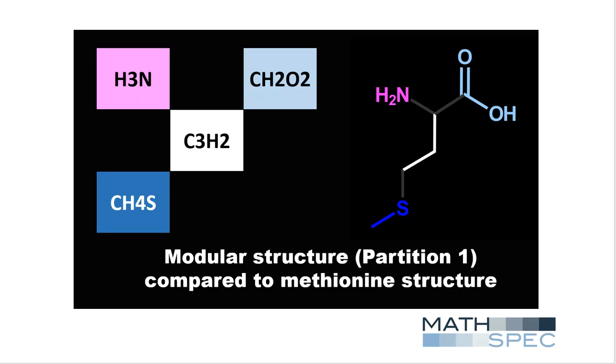However, mass spectrometry can only show us combinations of atoms. Essentially, a subformula is just a block of atoms. For example, the 3 subformulas on the outside of this modular structure are all connected to a 3-carbon block in the center. But to which of the 3 carbons? We cannot tell that from the data. Is the CH2O2 subformula block attached to the center by a carbon or by an oxygen? We cannot tell that from the data.